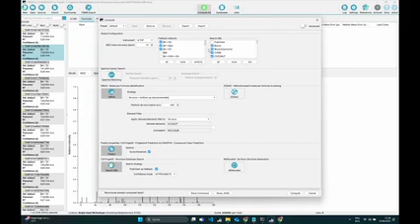Now, the other important global setting for many of the tools that we have below is the databases. So here, by default, all the biostructure databases are selected, but you can, of course, change this. And if you have custom databases, like Markus explained, you can also select them here.